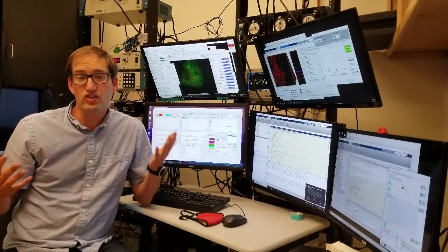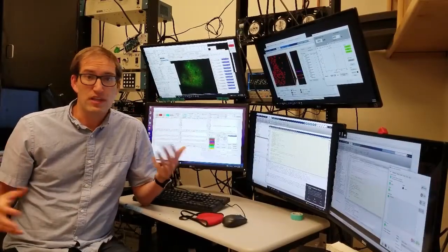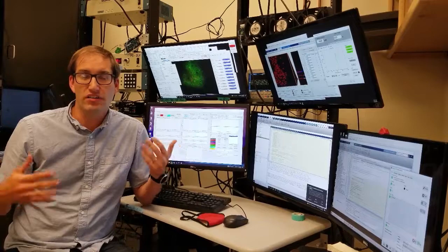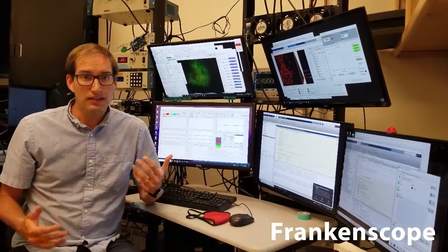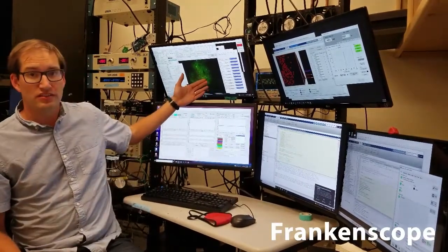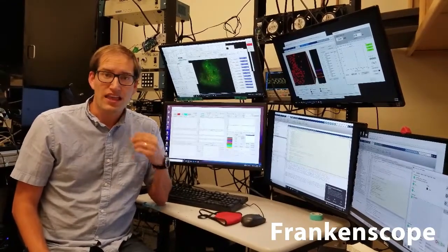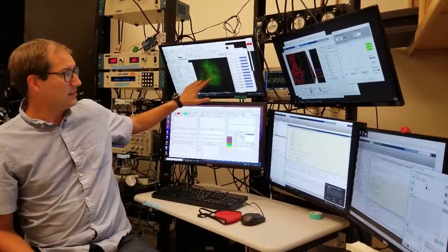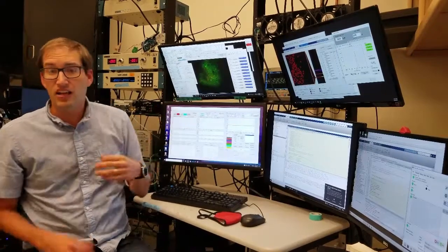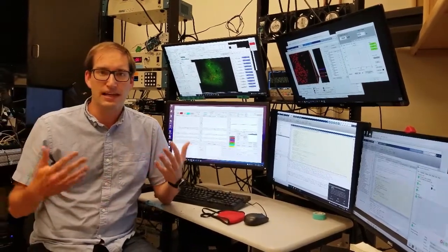So this is the first rig that we're going to show you today. This rig we affectionately call the Frankenscope. It combines a multiphoton imaging system with a multiphoton optogenetic stimulation system. This allows us to point to any cell that's expressing an opsin and cause that cell to fire in any pattern that we want.